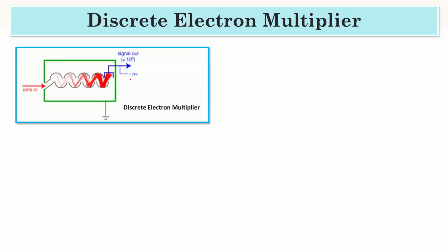You can see here they have given 2000 volts. So it's too high. So what's happening? When your electron is ejected and then it moves, more electrons will be ejected. Then again it is going to move here, and because they have high potential, again more electrons will be generated, and then again it will go here, to a higher potential. So the kinetic energy of your electron will be very high, and then again it will hit the surface, and more electrons will be generated.